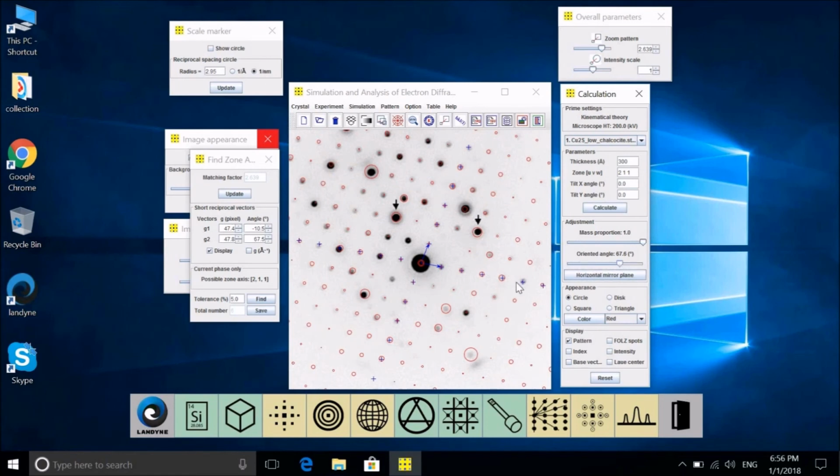And it seems to match perfectly with this pattern, with most of the intensity here, here, here, here, here, here, and the lattice also matches well. I can put a disk here to show you, and a circle here to show you. So it's a perfect match, except this point, and it could be because the simulation only approximately matches the factor of this one.